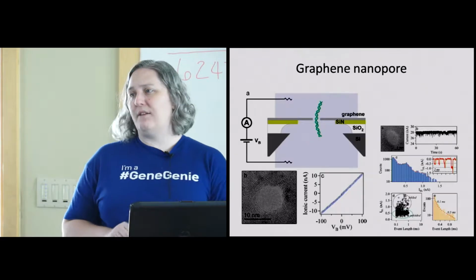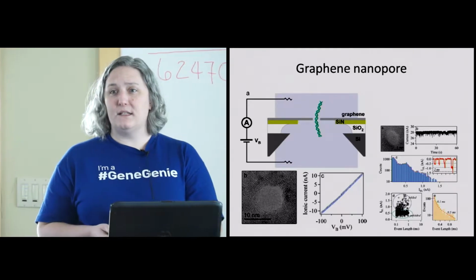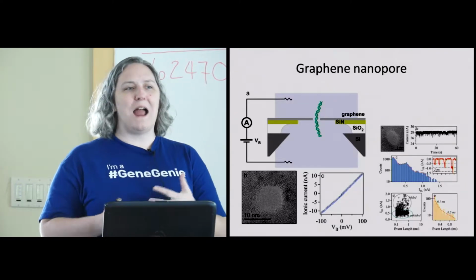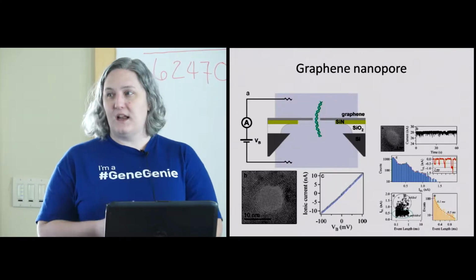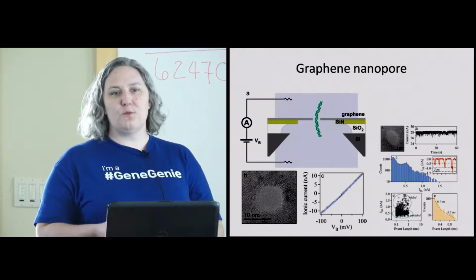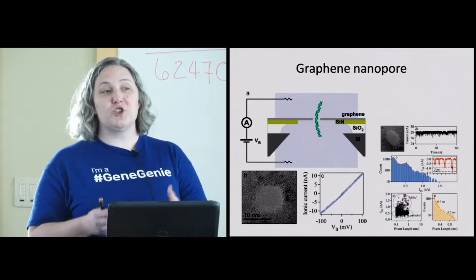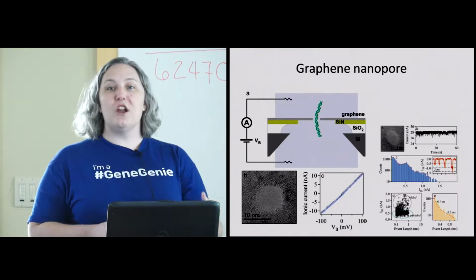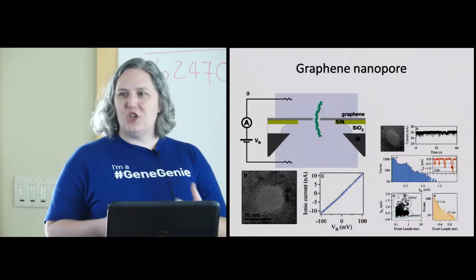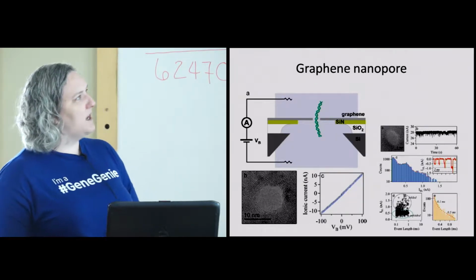One of the problems with graphene pores, unlike what's present in those alpha-hemolysin or MspA pores, is that there's no biological driving force for why the DNA translocates through the pore. There's no natural interaction between the amino acid residues and the DNA structure. There's no charge that's intrinsic to the structure itself. These are things that are engineered into it by people, as opposed to kind of the natural engineering that proteins go over, which tend, at least right now, to be better than what we can create de novo on our own.